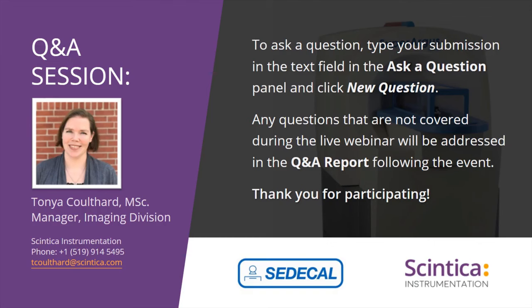The first question today is, and you might have mentioned this already, but are there any special room requirements for installing the SuperArgus PET CT system? Liam, it's a great question. As I mentioned earlier in the presentation, the system itself does meet the regulations set out by the FDA. However, these are for the CT system component itself. What people need to keep in mind is that when we're doing PET imaging, we're using radioactive tracers. And so there are specific things to consider when setting up the room for this.